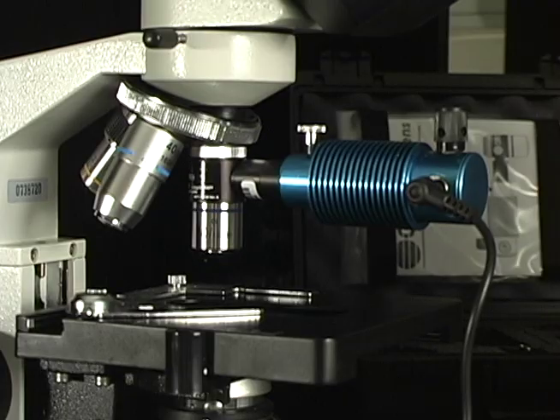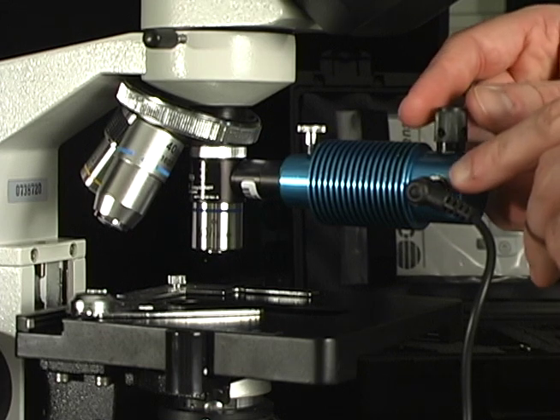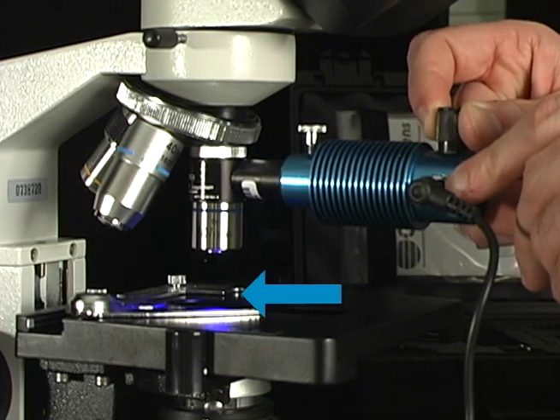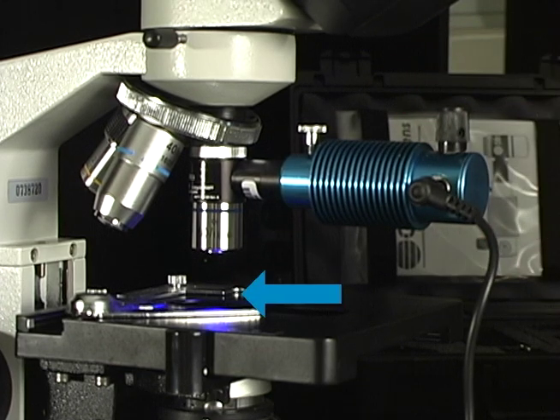Now the Paralens is attached and ready to be turned on. Locate the black intensity knob on top of the LED light source and turn it in a clockwise direction. A blue light will emanate from your objective, indicating that the Paralens is ready for use.